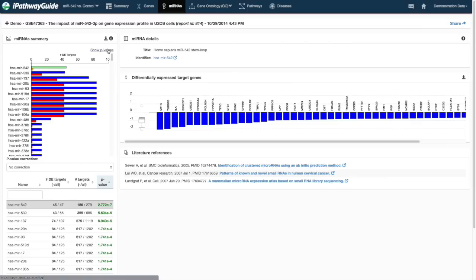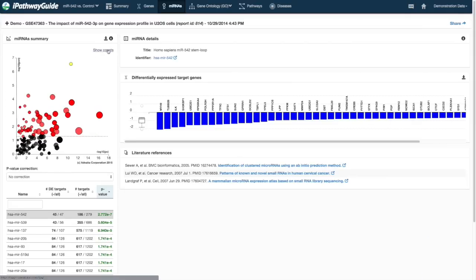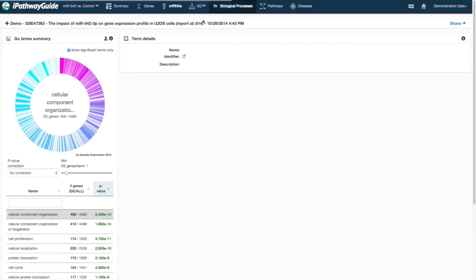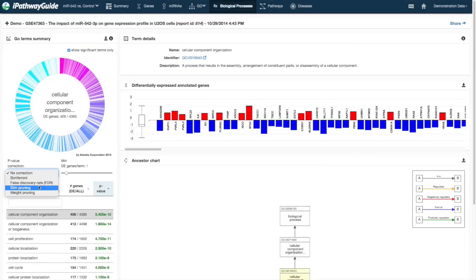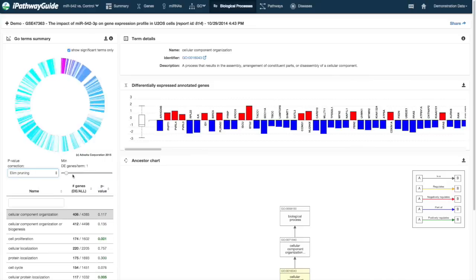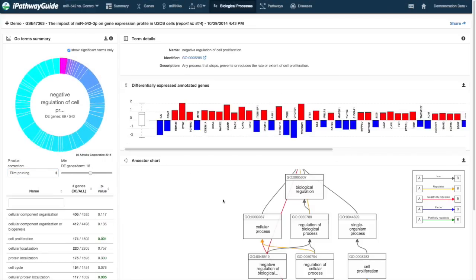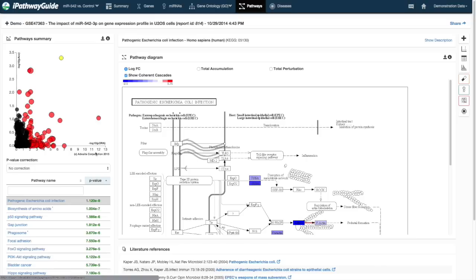iPathwayGuide offers the ability to identify possible active microRNAs based on gene expression signatures from your data. Gene ontology scoring is achieved with advanced correction factors including weight and ELIM pruning methods. Pathways are scored using impact analysis, which scores pathways using enrichment and topology or perturbation approaches.